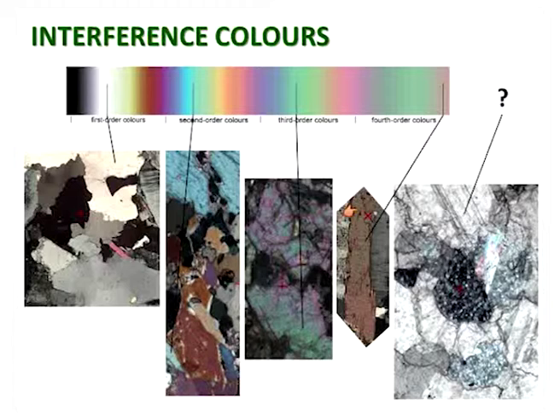And then on the right-hand side here, interference colours are kind of diagnostic. You can get it in metamorphic rocks, but you can also get it in sedimentary rocks, and not that commonly in igneous. Calcite, yeah. So calcite shows these very strange colours, which you sometimes get a kind of iridescent play of very psychedelic colours, but still fairly washed out. But most of the time it just shows this very washed out, almost pearlescent type of effect. So it's not quite white, but it's a kind of pearlescent, very washed out pale colours. And that's very typical.